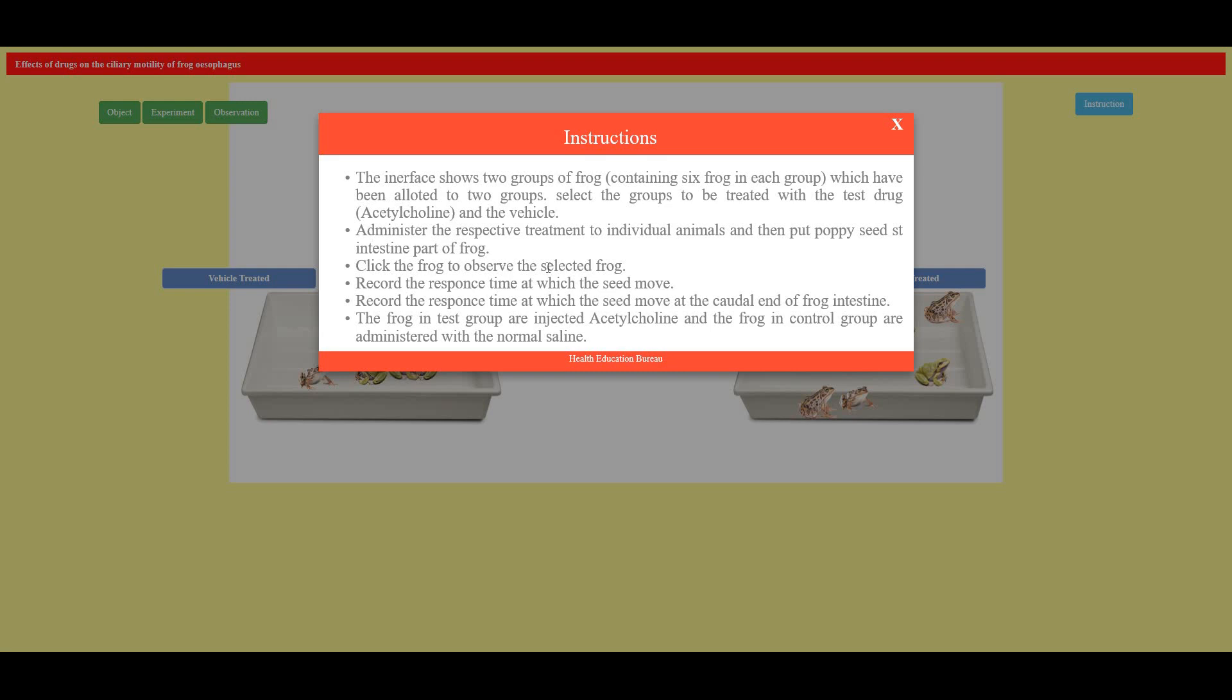Administer the respective treatment to individual animals and then put a poppy seed at the intestine part of the frog. Click the frog to observe the selected frog. Record the response time at which the seed moves.